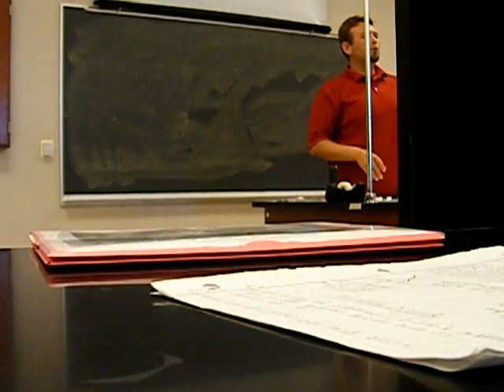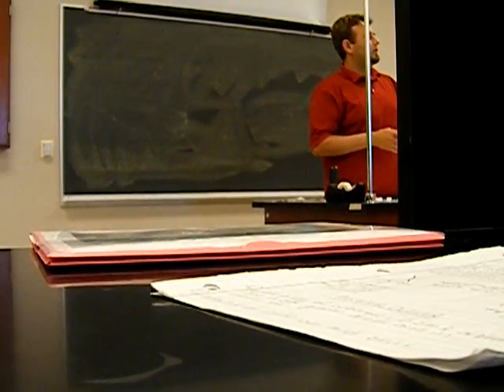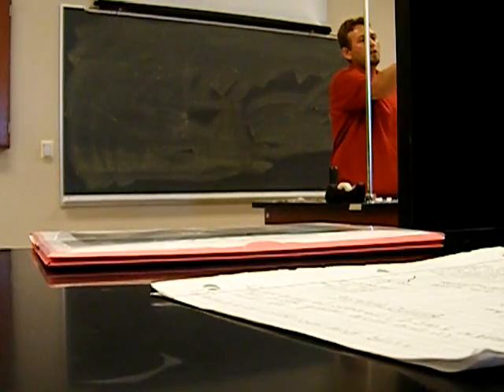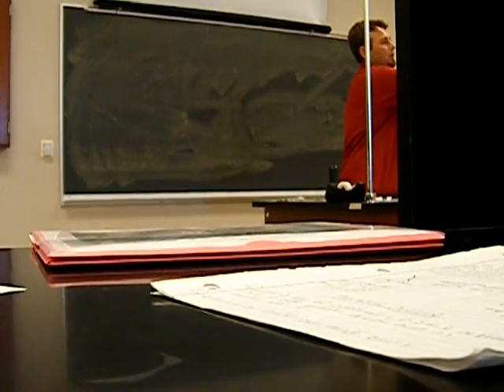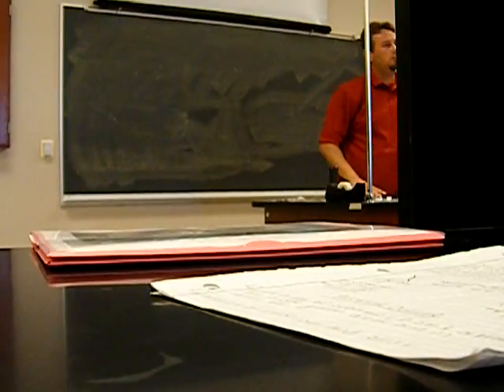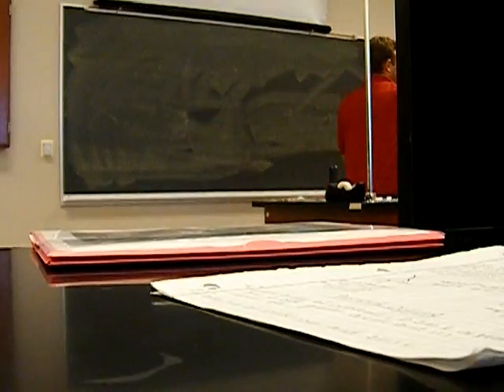Now, since the iodoform test does take a little while, each group is just going to test one of those. So I'm going to go along right now to each group and assign which reagent you should use. And then the group that's next to you, you get their results for their reaction, and then you give them your results for your reaction. Okay?